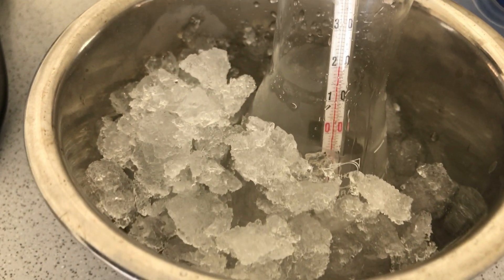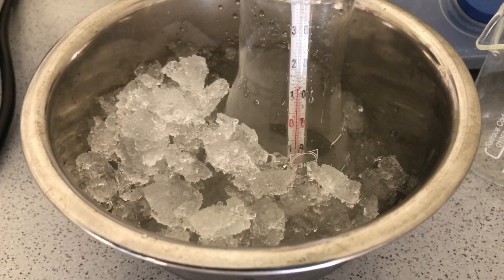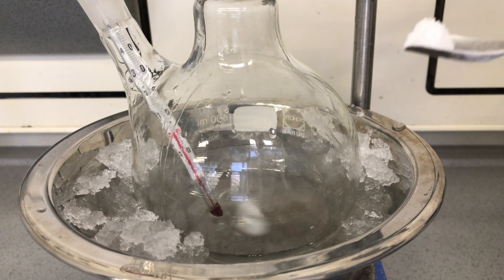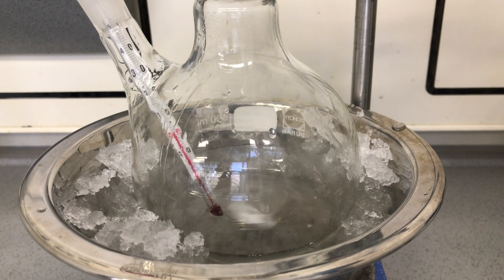We ended up pouring the finished nitration mixture into another flask sitting in an ice bath. This is not nitration mixture anymore — this is 50ml of sulfuric acid which we added to the flask from before.